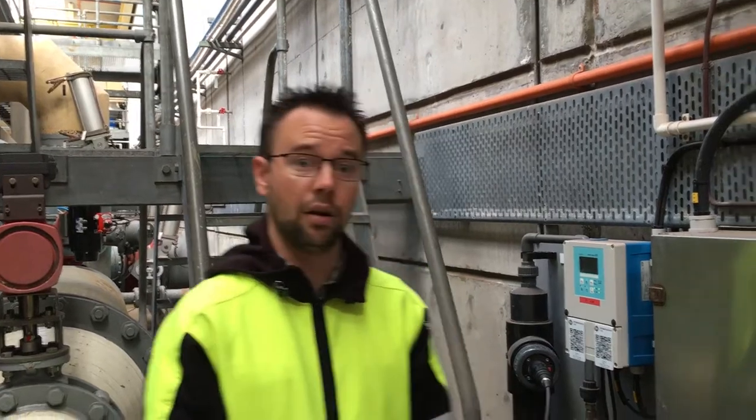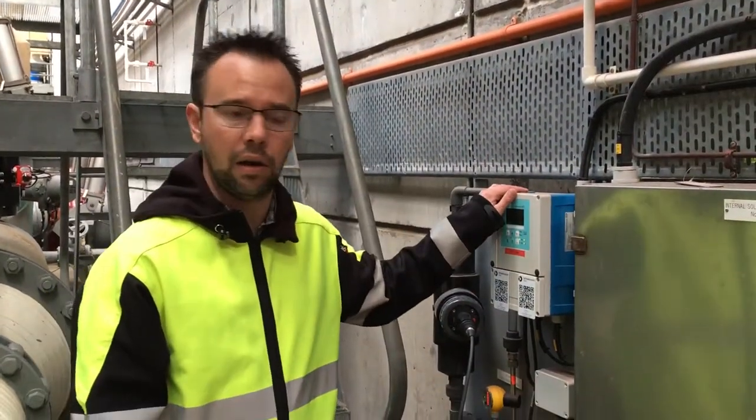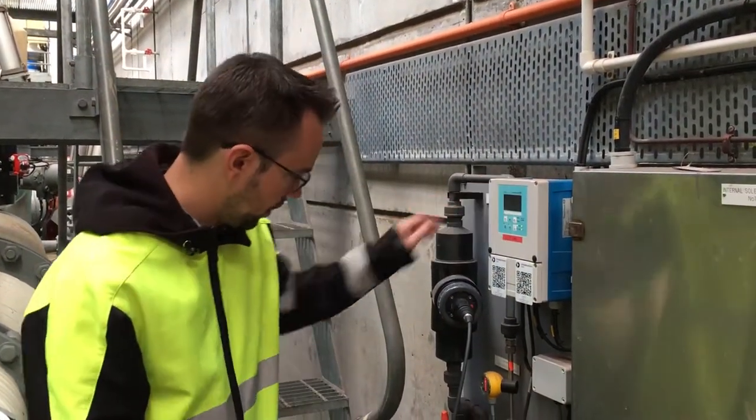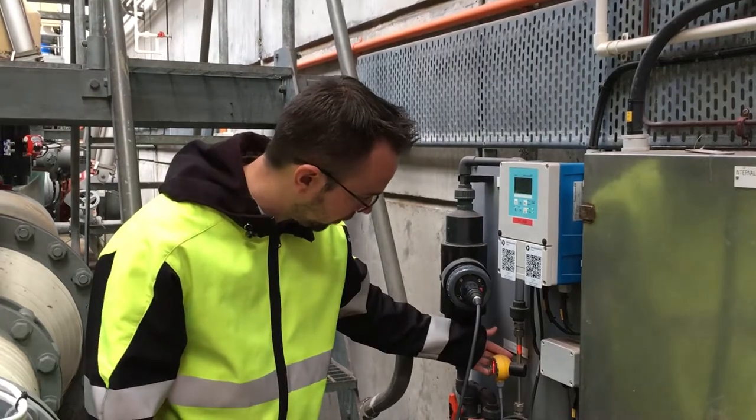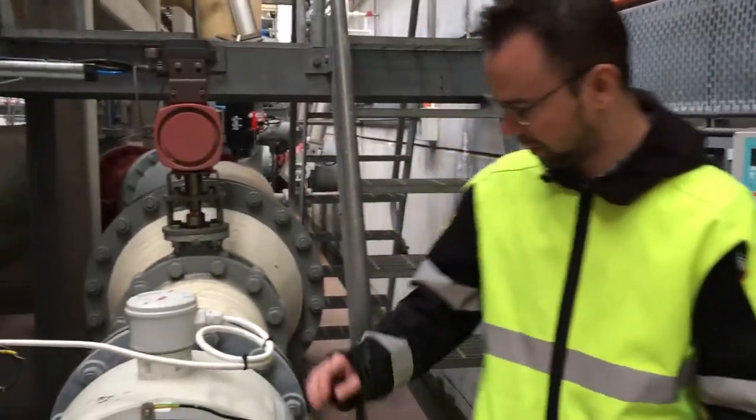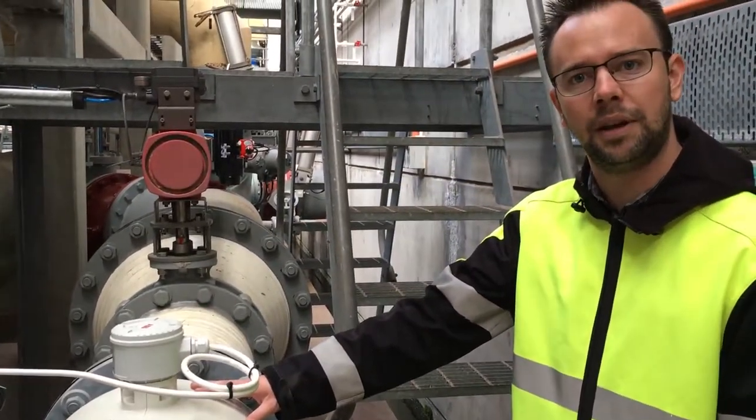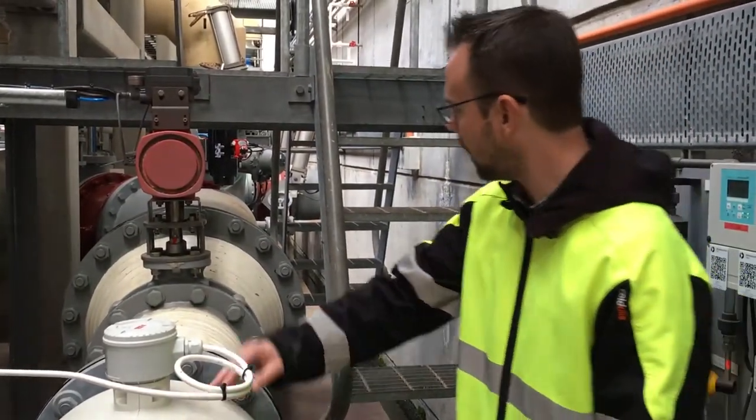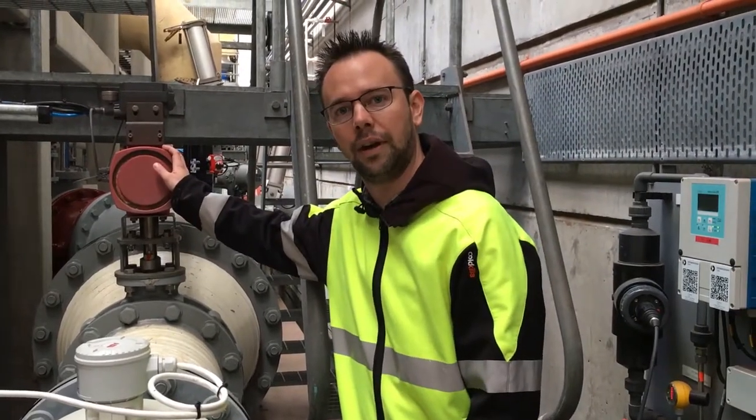This is where we have the instruments with which we demonstrate compliance. Over here on the wall we have the turbidity analyzer, the turbidity analyzer's flow switch, and on this side we have the filter outlet flow meter and also the filter outlet control valve.